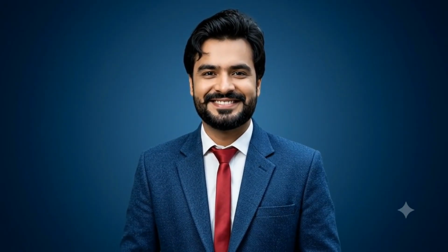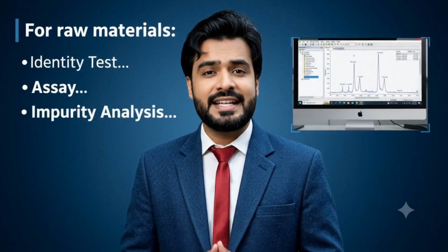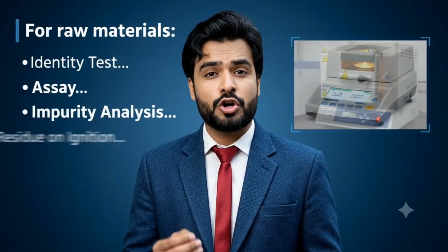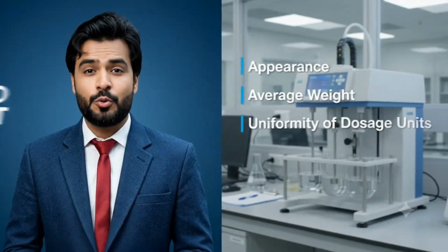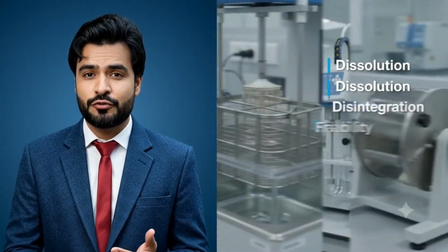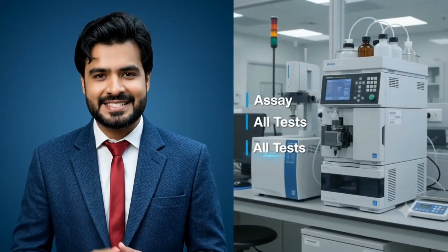Now comes the most exciting stage, actual laboratory analysis. Depending on the product, different tests are performed. For raw materials, we perform many specific tests. We begin with an identity test. Then, we measure loss on drying. We monitor heavy metals and particle size. We check appearance, weight and dosage uniformity, friability, hardness, content uniformity, and the assay.